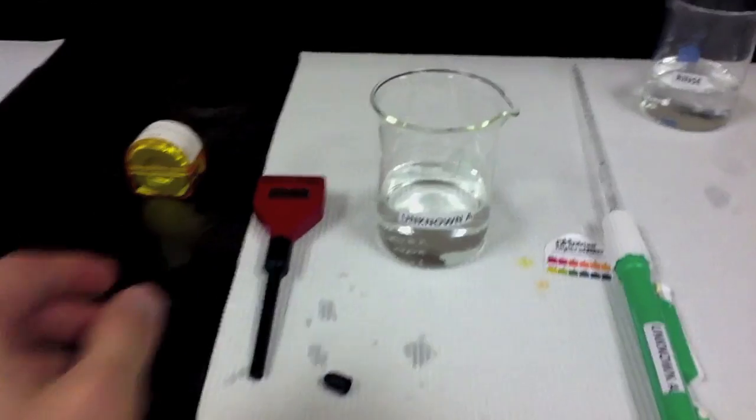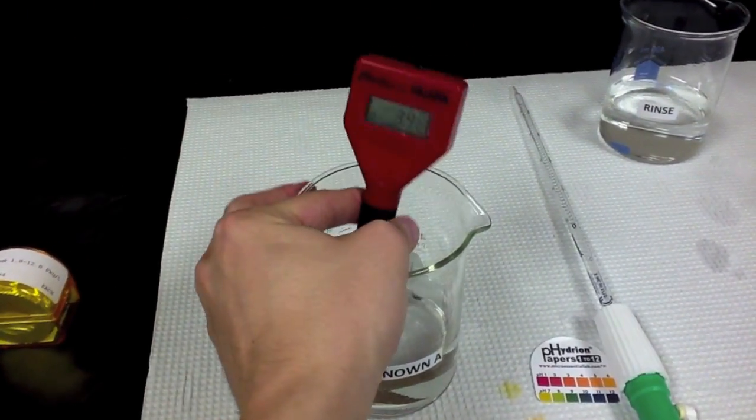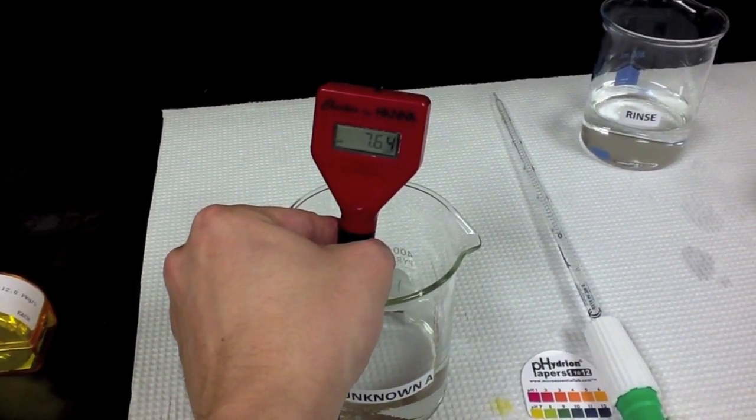After we've calibrated our pH meter, we can place it into a solution of an unknown pH and the meter will display the pH of that solution.